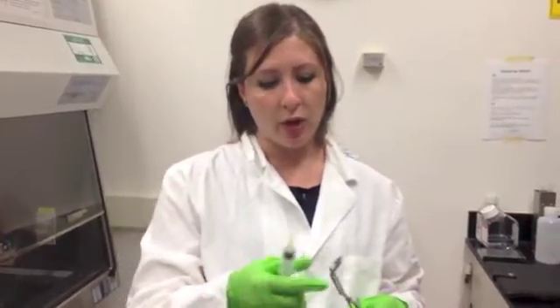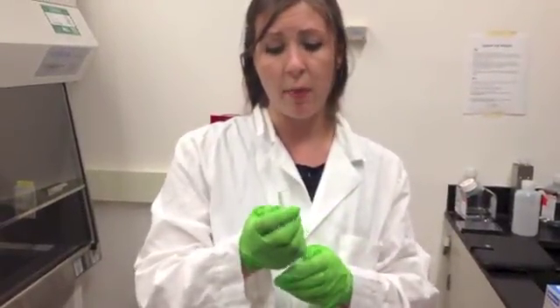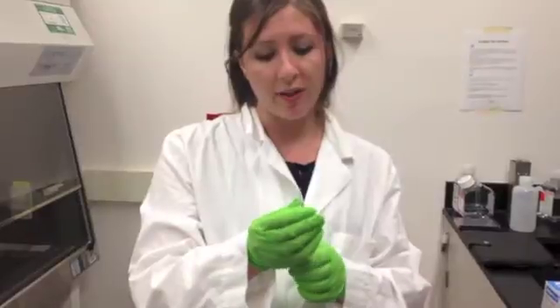What you never want to do is try to pop the cap off with one hand. You never want to recap — we'll talk about that in a second. But you never want to do one of these. That's another very risky procedure, and there's really no need to do it.